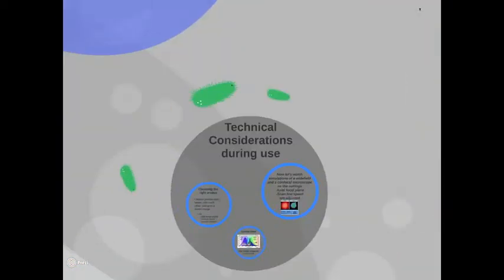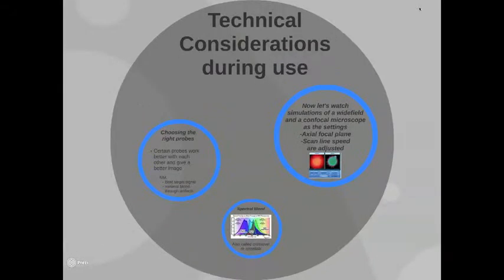There are some things to consider when using a confocal microscope in order to obtain better images and 3D constructions.